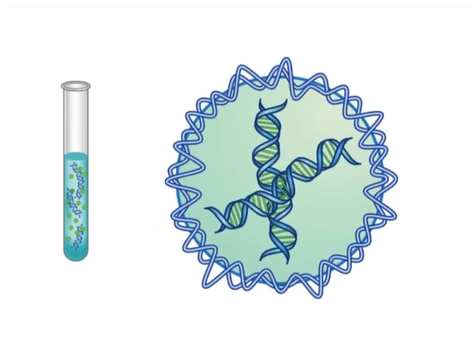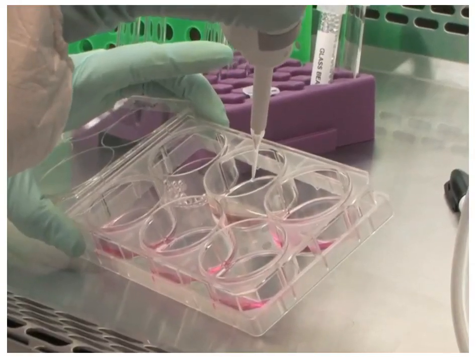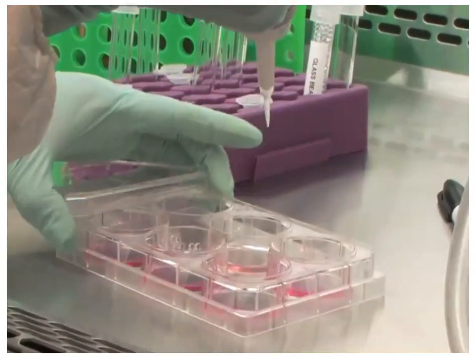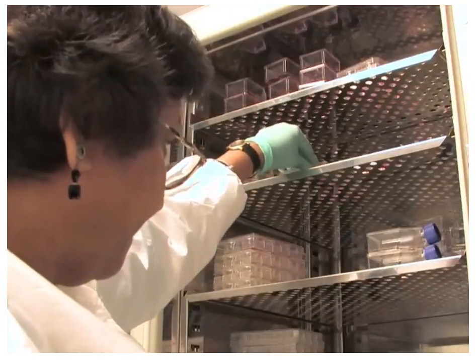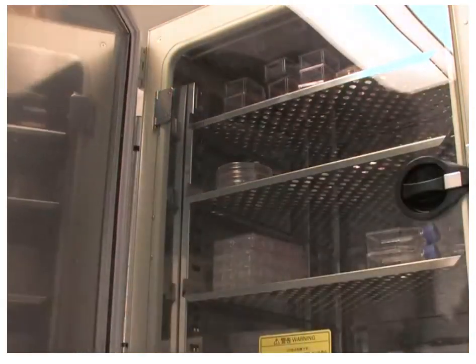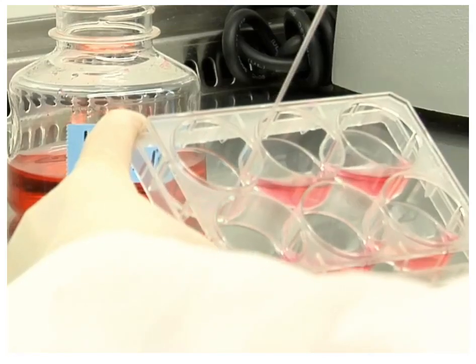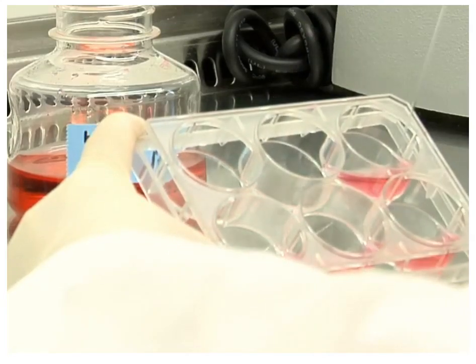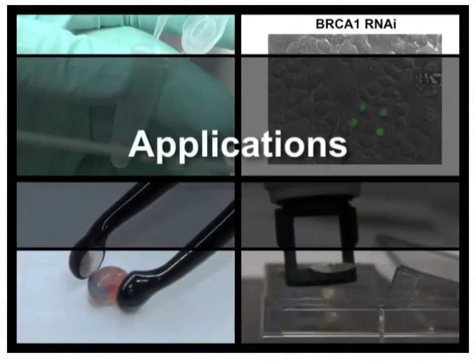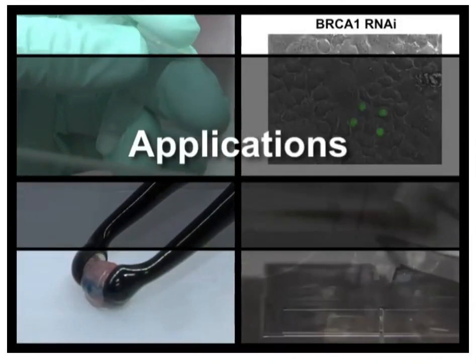For each chemical delivery system, the specific concentrations of each component must be optimized. The nucleic acid reagent complexes are then added to the plated cells and incubated, often overnight, to give plenty of time for the complexes to attach to the cells and mediate transfection. After 24 hours, the media should be removed and replaced with fresh culture media. Many variations and applications of transfection exist.